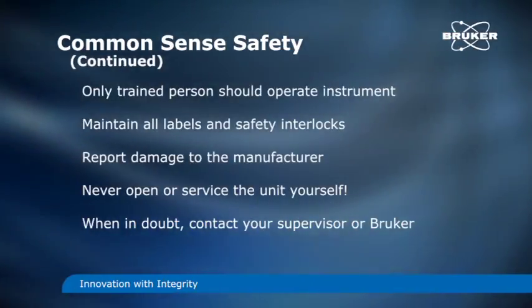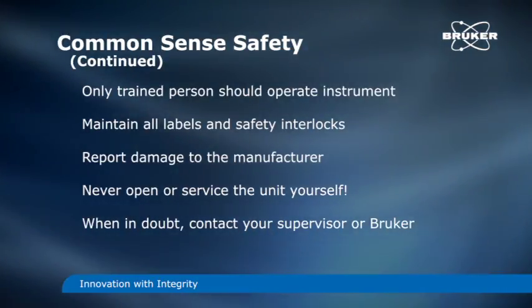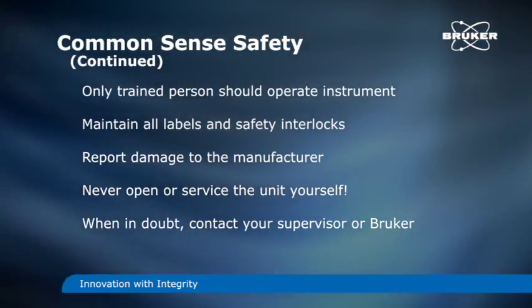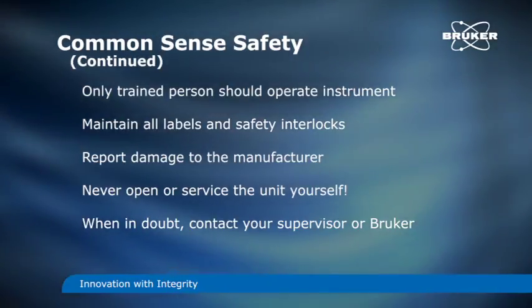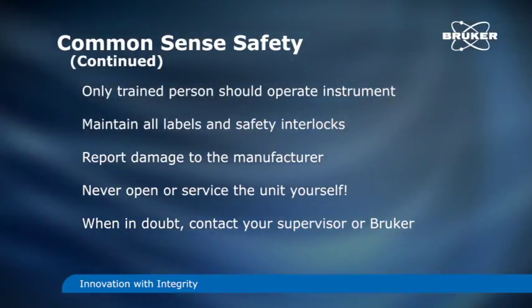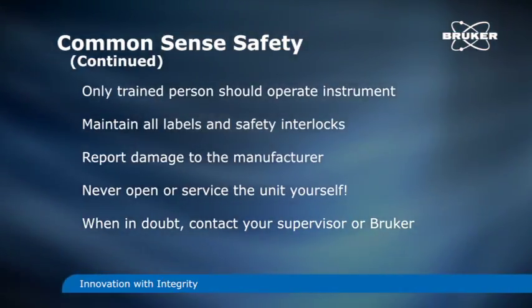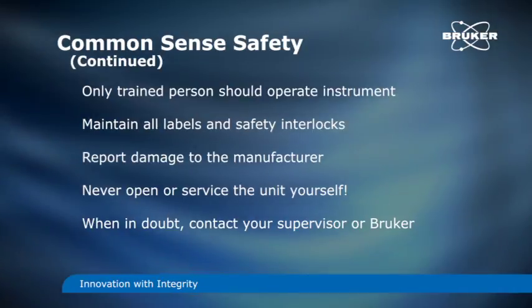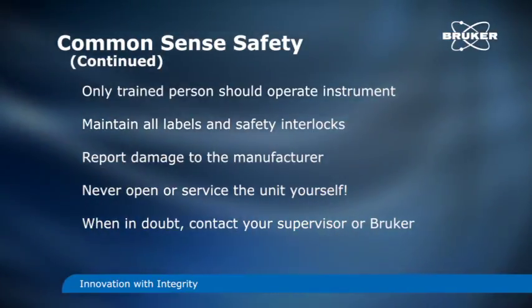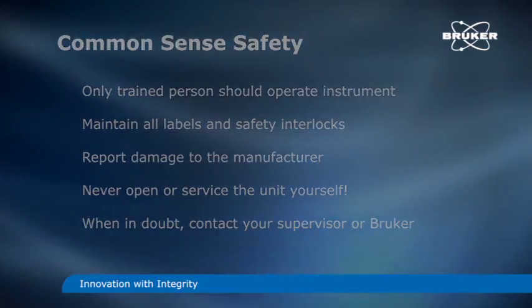Only trained personnel should operate the instrument. Do not remove or deface manufacturer radiation labels. Never defeat or tamper with safety interlocks. Report any damage of your analyzer to the manufacturer. Never open or service the unit yourself. When in doubt, contact your supervisor or Bruker Elemental for assistance.